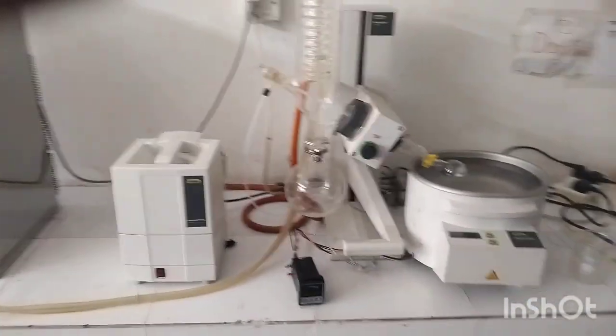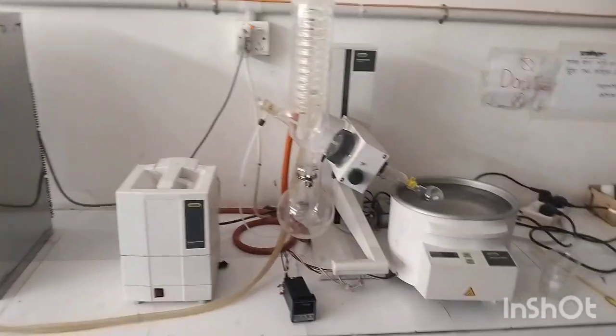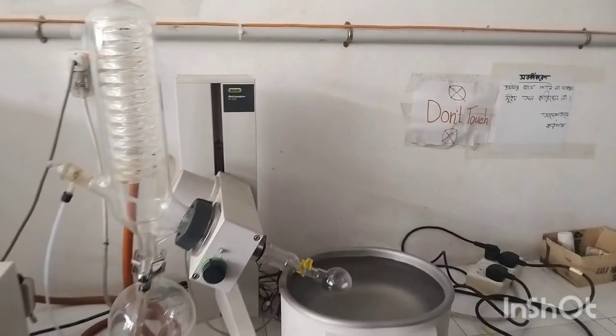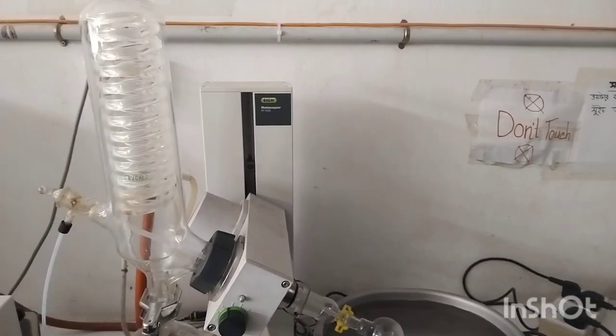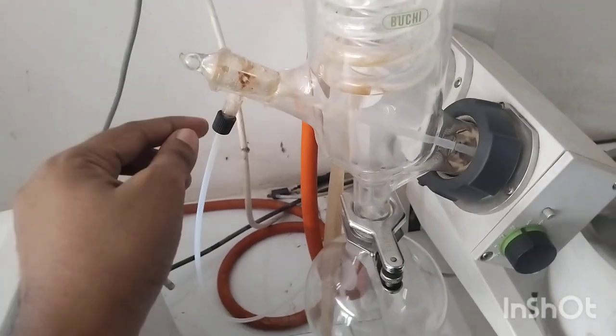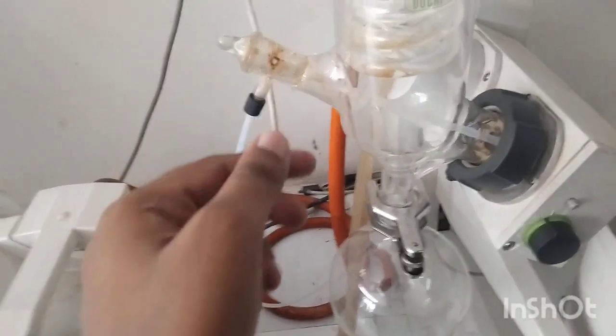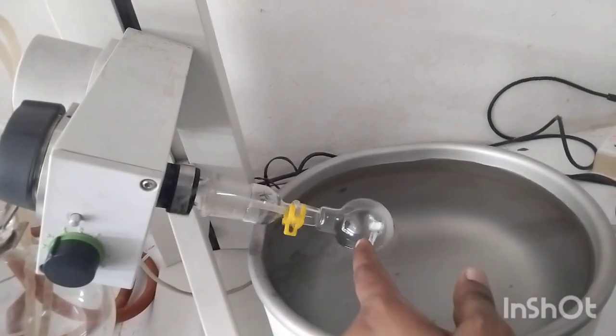And the next one, you have to keep in your mind that in case of applying this specific system, when we complete our overall drying, then obviously we can change this specific handle to the lower portion, so that this specific pore and the lower pore will be aligned, and the vacuum will be released, and we can easily open this specific RB.